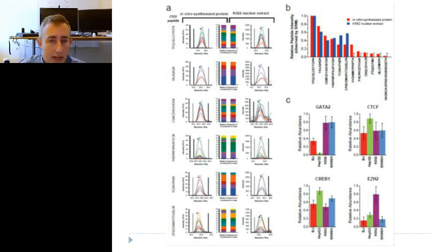We feel pretty comfortable now that we have absolute structural specificity, because we have not only the hydrophobicity of the peptide, the mass of the peptide, and the mass of the fragment. We also know now the rank order of the individual fragment ions, which provides a very strong qualitative confirmation that we're measuring what we think we're measuring.